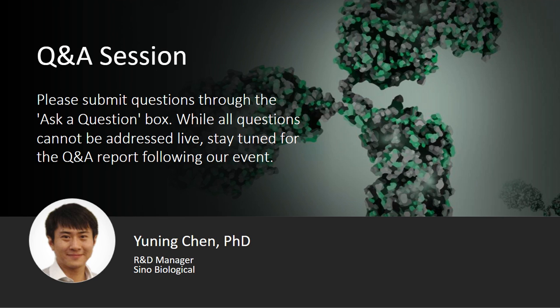That's actually a very good question, and it's something that we encounter all the time. But I think it all boils down to two points. In order for a buffer to be suitable for an antibody, we would need to consider the compatibility with the follow-up assay, as well as the stability of the antibody within this buffer. I know that a lot of people use PBS buffer, and because it's a quote unquote physiological buffer, it does have a lot of advantages.